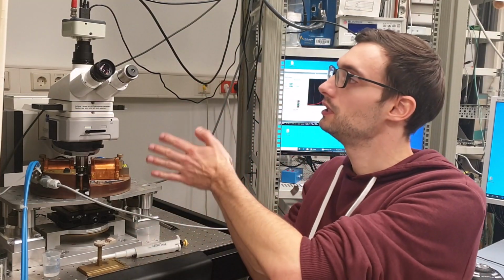I work at the IFW in Dresden and I will give you a short introduction to Kerr microscopy and in situ Kerr microscopy. The Kerr microscope, which you can see here, uses the magneto-optical Kerr effect to measure magnetization curves and to visualize the magnetic microstructure. The magneto-optical Kerr effect describes the rotation of the plane of polarization of light when it's reflected from a magnetized surface. And a Kerr microscope is in principle a light microscope but uses linear polarized light.